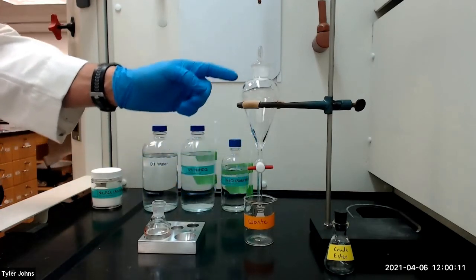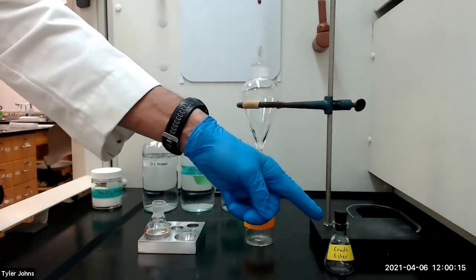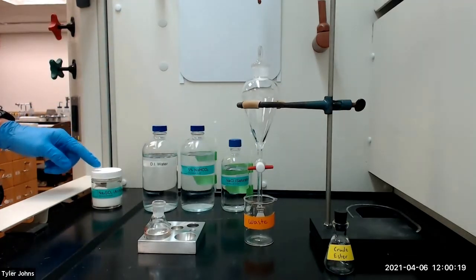After the third extraction, we will transfer the crude ester to a 25-milliliter Erlenmeyer flask and dry over anhydrous sodium sulfate for 10 to 15 minutes.